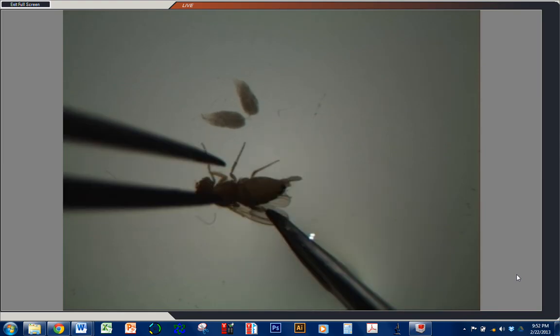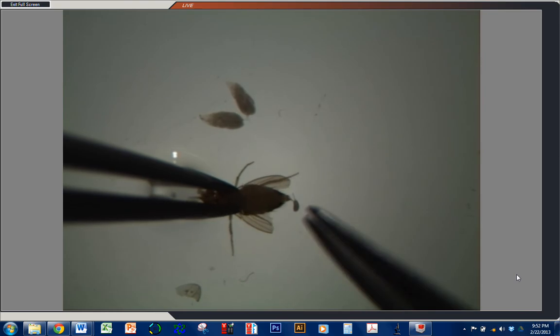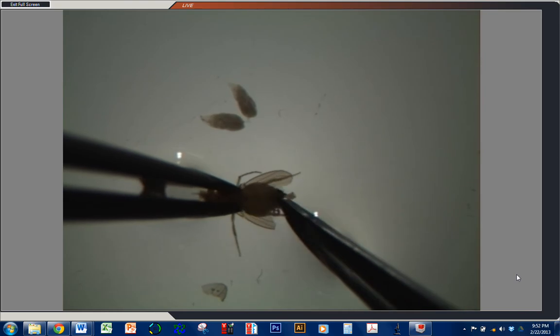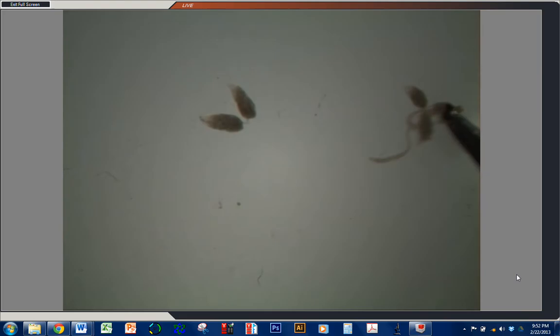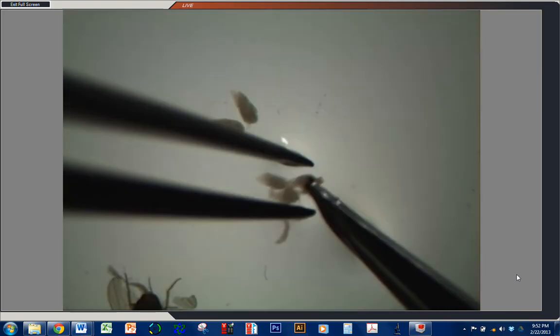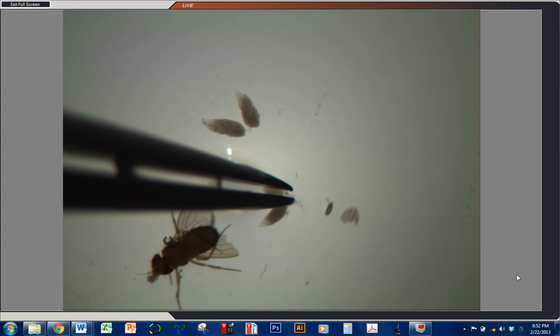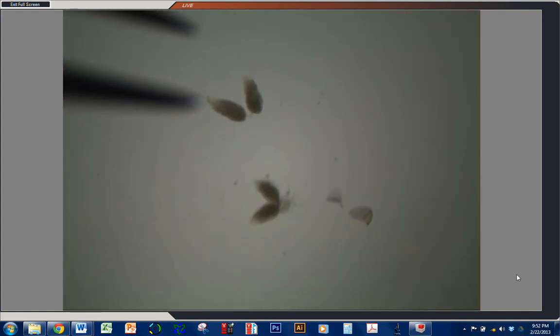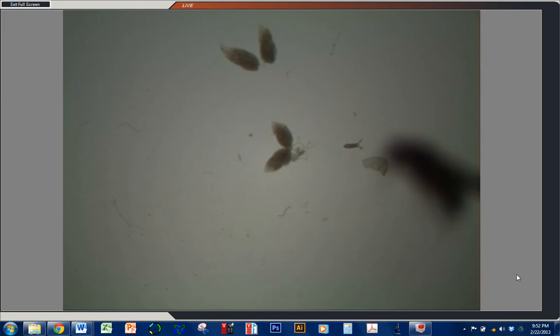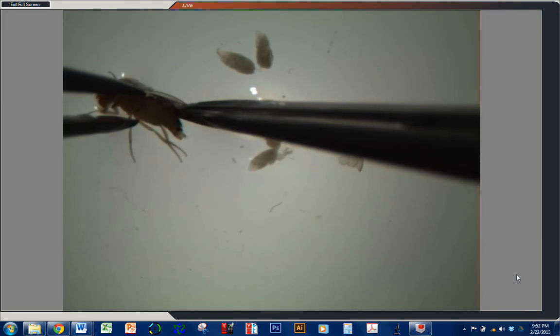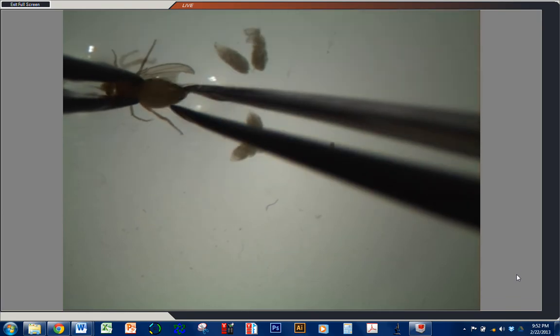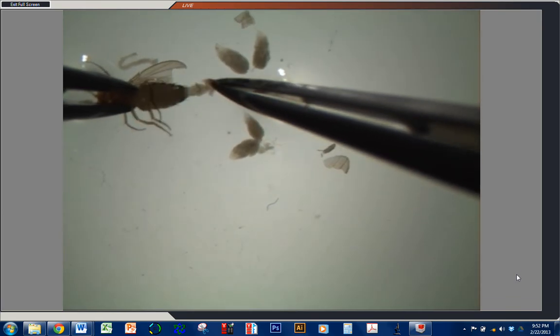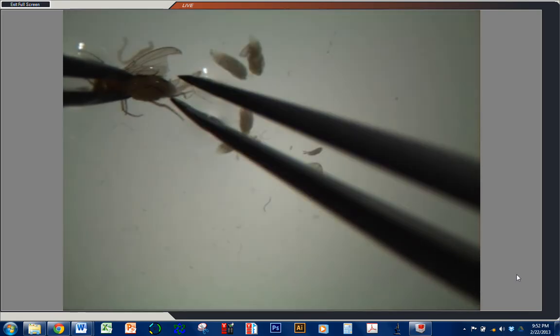So here's one of her sisters. Hold her with the left tweezers and the right grab. Well, wouldn't you know, we're getting another one right away. Okay, I'll try this one more time. If they come out straight away, consider yourself lucky.